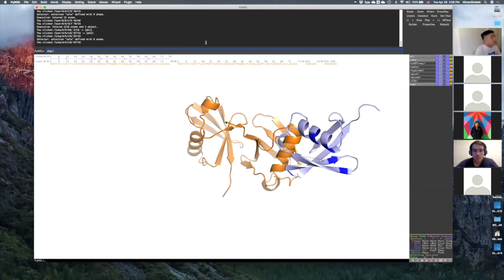So I'm going to press align, one ubiq, that's the one that's going to move, comma, and I can either press 1 AAR, or I can just do the initial and press tab. It will complete it. So tab is actually really good to complete some stuff, okay? And then I press enter.